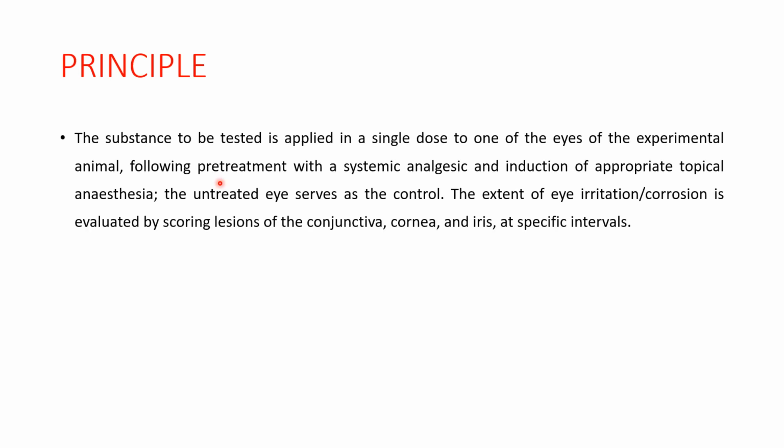Now we'll see the principle. The substance to be tested is applied in a single dose on one of the eyes of the experimental animal, and there should be pre-treatment with a systemic analgesic and induction of appropriate topical anesthesia. These two steps are very important in order to reduce the distress to the animal.